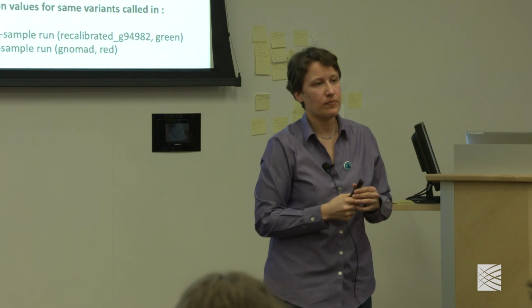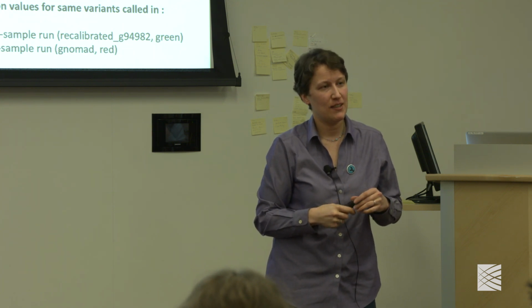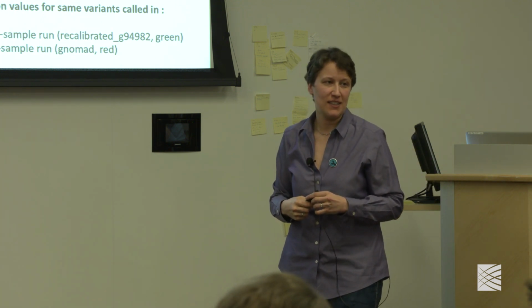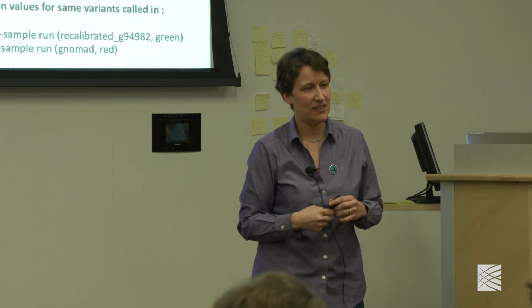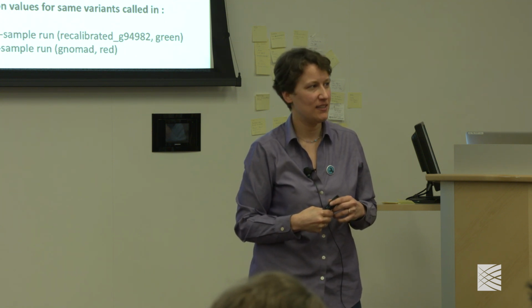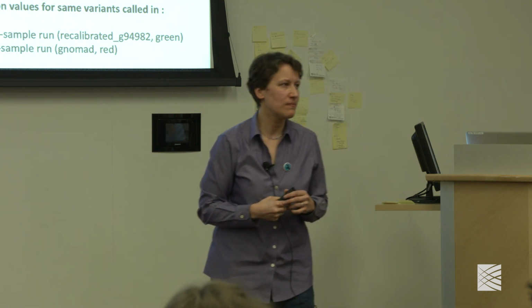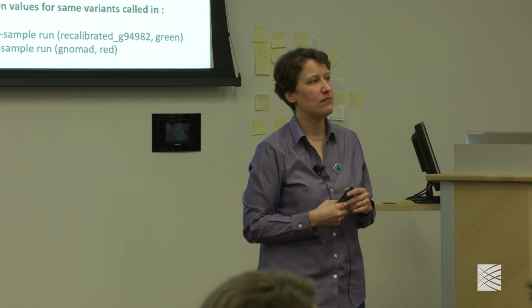Just looking on the x-axis, sorry about maybe being picky, it seems like both the smaller and the larger mode of the red distribution are on the right. So you claim that only the negative ones are the wrong ones. I'm trying to figure out the separation that we see on the red histogram. Well, this is part of the reason that we use a machine learning model, because a lot of the annotation distributions won't actually fit the expected for various reasons, because sometimes there actually is an innate bias in the sequencing.